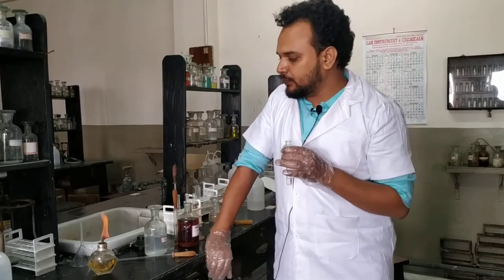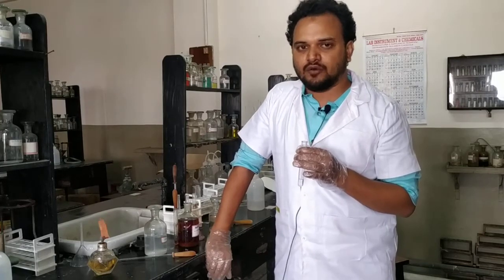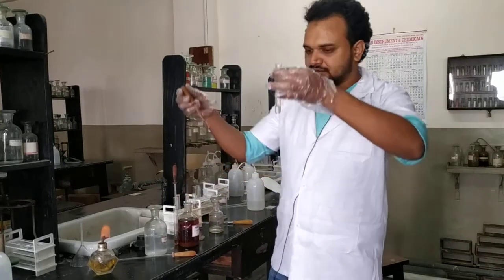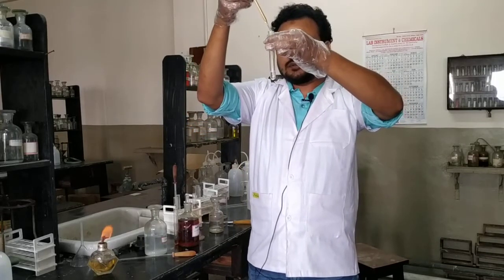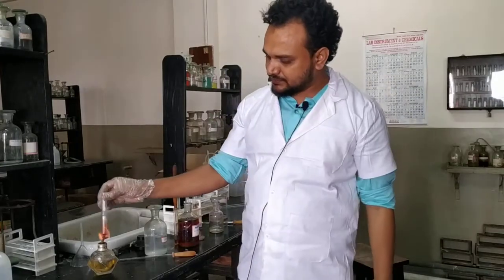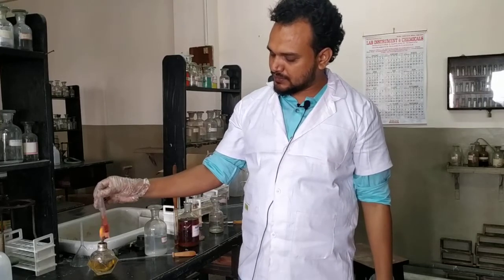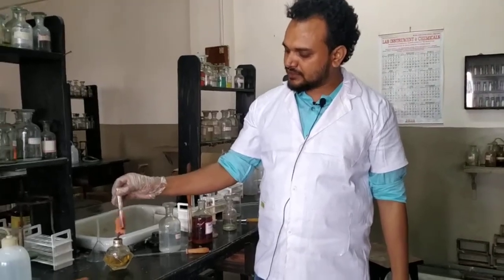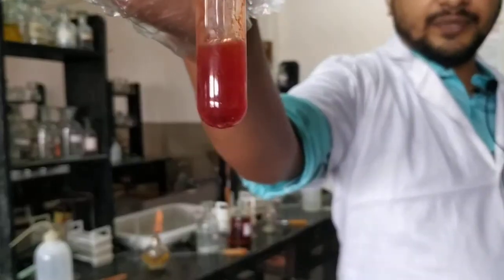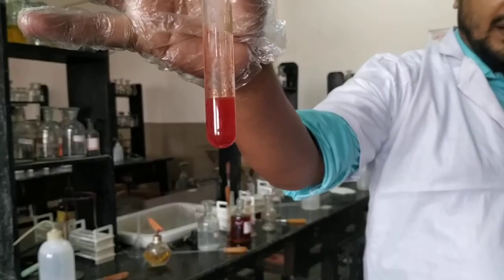On heating it will turn ruby red color — you know ruby gems — so that ruby red color will appear, which on standing will fade and give a faded yellow color. Let us see what happens. I will add only 4 to 5 drops and immediately warm it. A brilliant ruby red color appeared. Now I am keeping it to cool down and slowly it will fade and turn yellow.